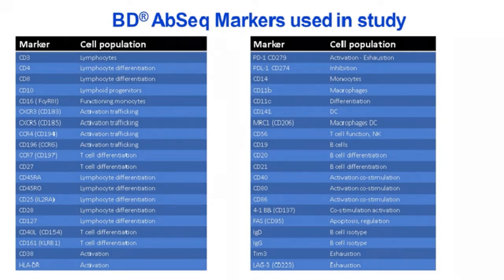And then we also included 7 markers that allow us to characterize the monocytes in more detail. For instance, we have CD14, and then we considered CD11B and CD11C. We can also characterize dendritic cells, as you can see, by markers such as CD141, and several other markers. So the idea was to use our best knowledge to select these AbSeq markers to characterize every single type of cell that we would encounter and measure in the blood.